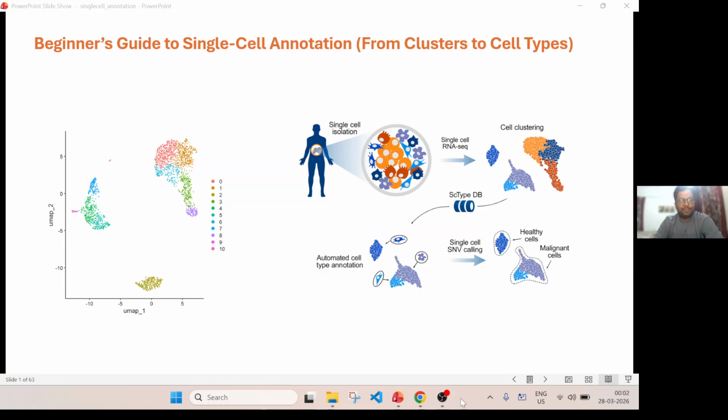Hi everyone, I'm Priyabrat and I'm super excited to welcome you all to a new exciting video series on single cell annotation. In the past, I had recorded a few videos on the Seurat pipeline where we analyzed single cell data and came to this stage where we obtained the single cell clusters, right?